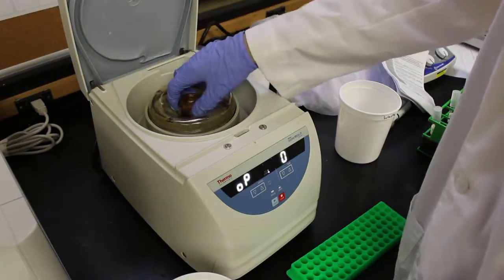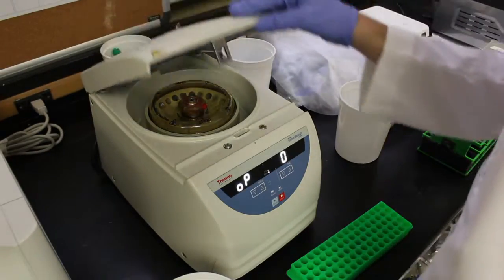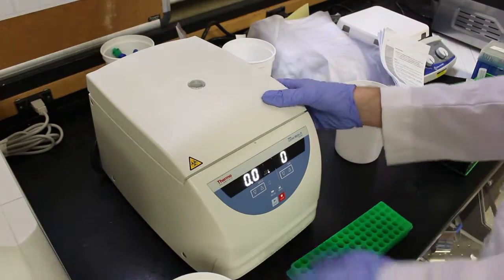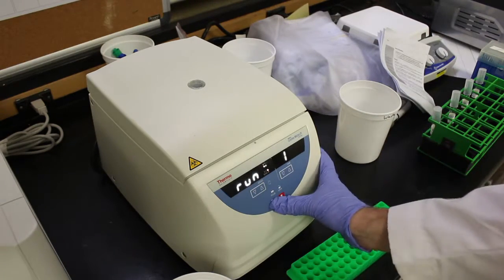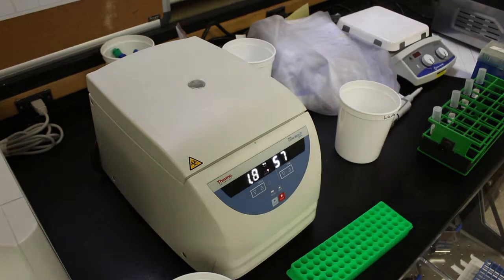To pellet, simply spin down the tubes at around 15,000 g's for a minute and discard the supernatant. Remember to label your tubes before you begin pelleting. 15,000 g's simply stands for 15,000 times the gravitational acceleration of the earth.